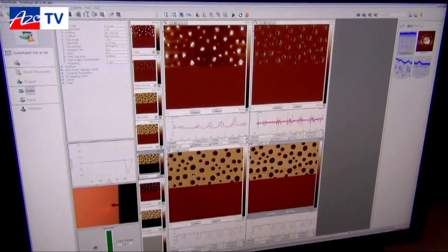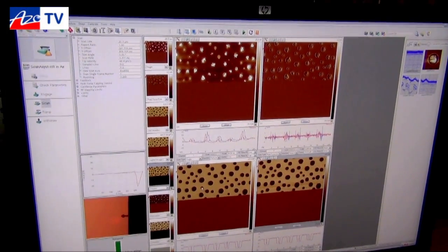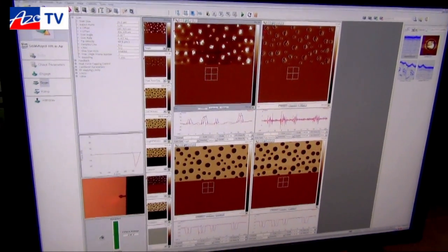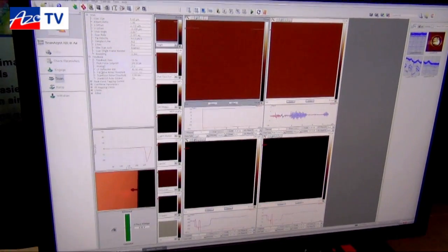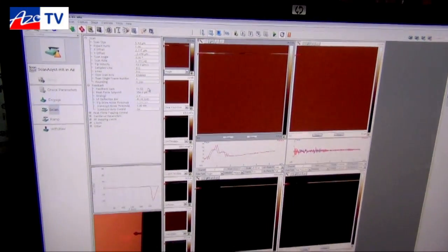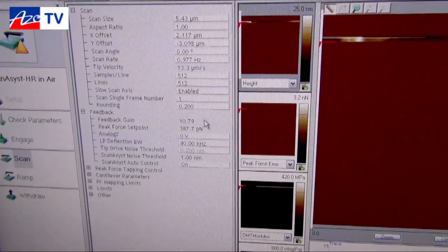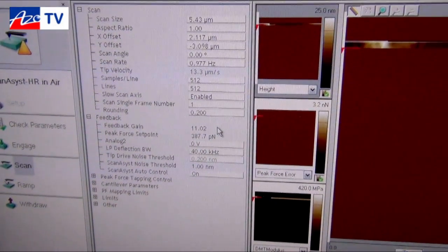The second advantage is that the cantilever dynamics are a little bit different, which allows us to move to something called ScanAsist. From a user point of view this is great because it means you can do things like zoom in, zoom out, change the speed, and in real time the system will update the gains, the set points, the scan rate, and the z limit in order to track the surface for you. It makes the user experience easier for those people who aren't used to AFM, allowing them to take great quality data from the go.